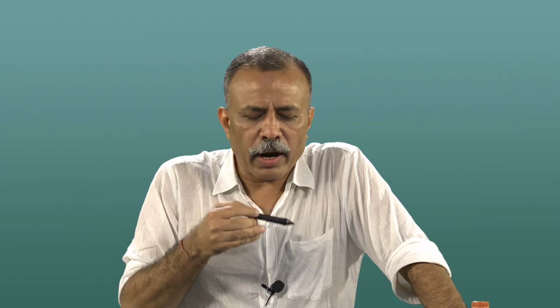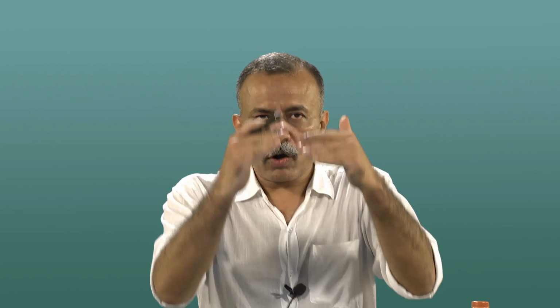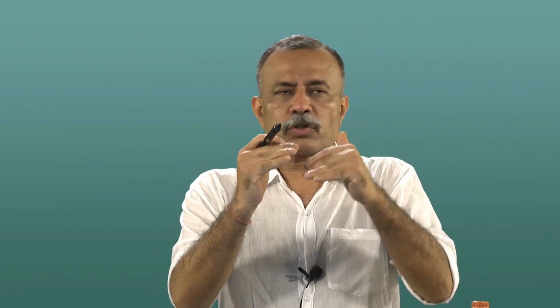That gives even more additional information, and specifically this is very important when we are looking at a virus surface, because whenever we draw a cell, we draw it like this, but in real life a cell is never like that. A cell has a lot of curves and bends and everything, and they are all very soft matter. They are very flexible, they change shape.